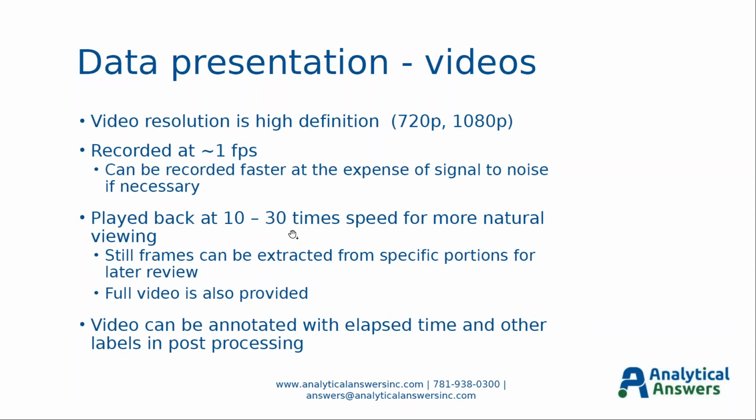which take a long time to watch, and I'm not going to make you sit through a 40-minute video, but it can be played back at 30 times the speed for more natural viewing, and then you can see all the changes occur in just a minute or two. We can extract high-resolution still frames from specific portions of the video, so you can later review how the sample looked at a specific time, temperature, or pressure. And customers always get the full video, but for this presentation, I'll just select portions. And of course, after the video is recorded, we add things like annotations and elapsed time in order to make it nicer to watch.